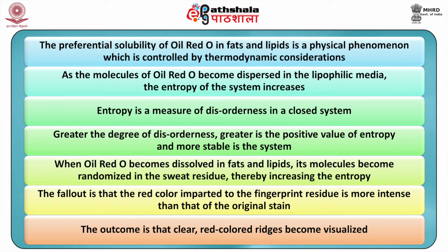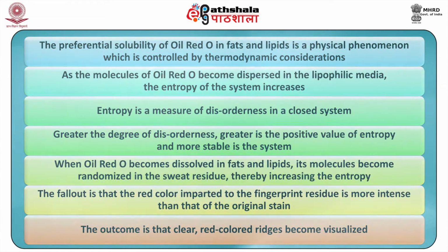The fallout is that the red color imparted to the fingerprint residue is more intense than that of the original stain. The outcome is that clear red colored ridges become visualized.